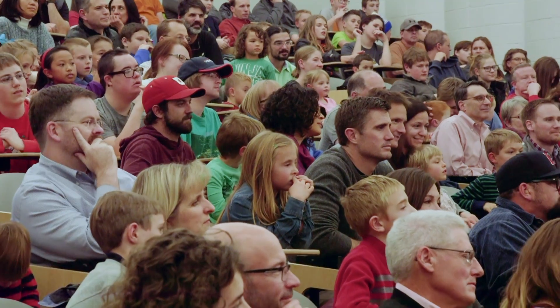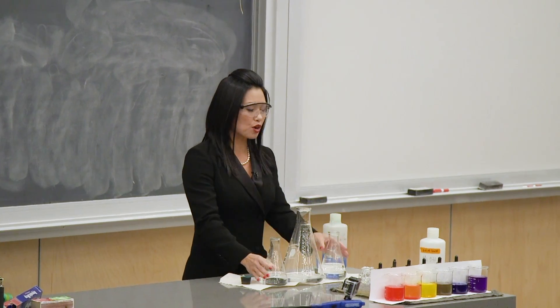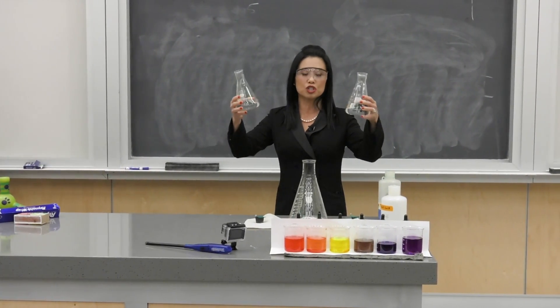As you can tell from the first couple of experiments, I really like color change. I'm going to have some clear liquids, pour them in, and what you'll see is a nice yellowy-orange color.